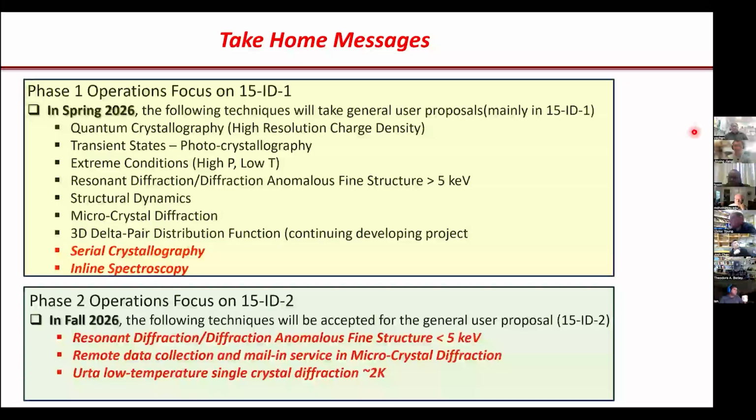Yes, that's the one thing a lot of users have been requesting. Since the beam time, I mean data collection, is so fast, they come here, collect some data, but somehow they have some beam time left. They say, can we do some powder?